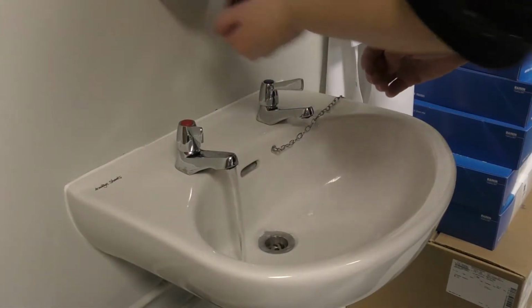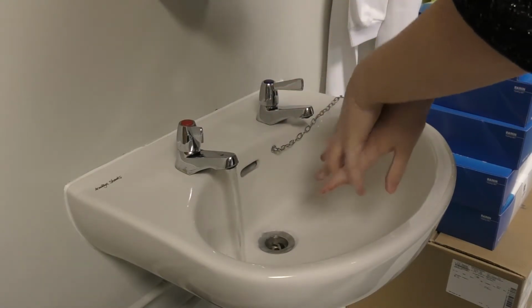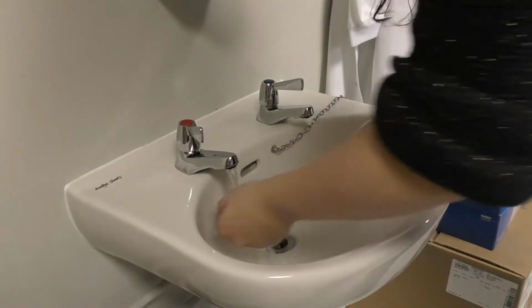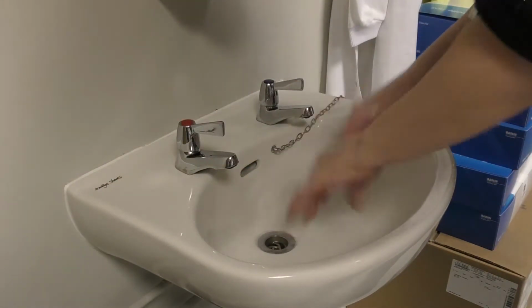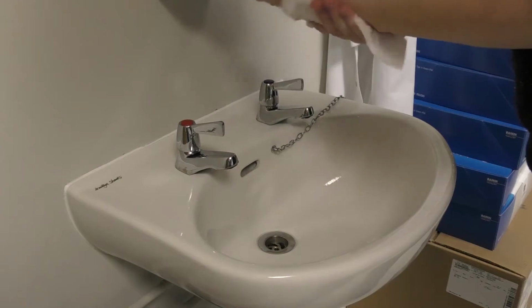Before starting any of your processes, you need to ensure that you've undertaken hand decontamination through hand washing, and that you're wearing all the required personal protective equipment that is appropriate for the task you're about to undertake. These will be listed in your standard operating procedures and will include items like lab coats, gloves, goggles, and masks as needed.